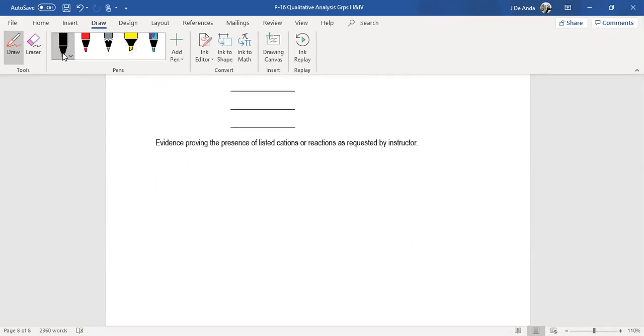And once more, like I always tell you, it might be good for you guys to do a flow chart. Remember, we like to do flow charts here. So I would do a flow chart here. That's how you can follow. Now remember that the flow chart that you do in this section is not like the one they gave you for the experiment, because that was for a known mixture. And in this case, you have an unknown.